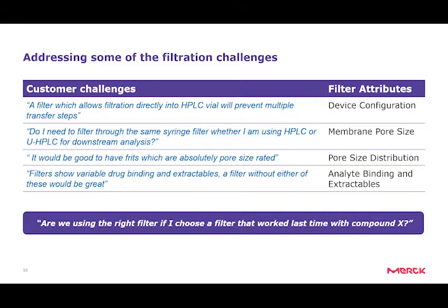Some of the filter attributes that this causes is the device configuration. When I started doing these seminars, UHPLC was new in the space, and people were concerned whether the same filter that they were using for HPLC analysis could be used for UHPLC or not.